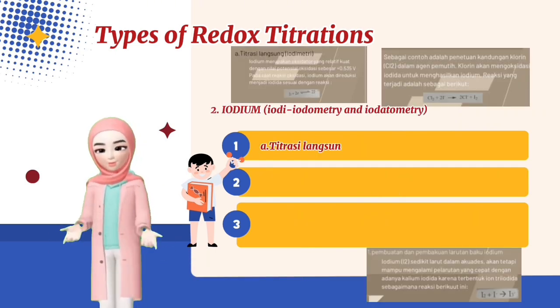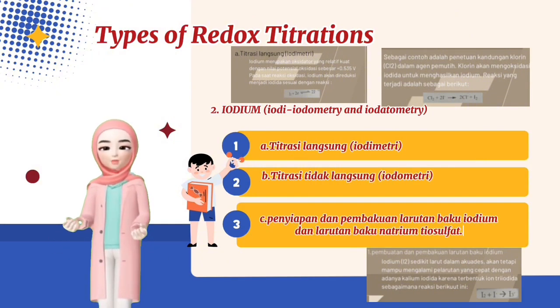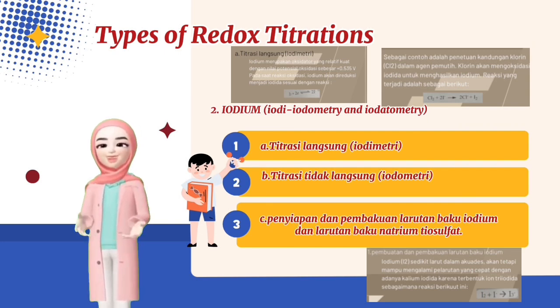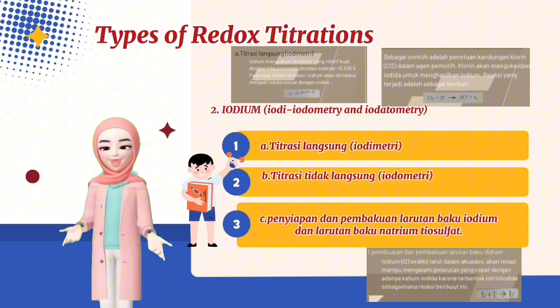Iodine: iodometry and iodatometry. A. Direct titration, iodimetry. B. Indirect titration, iodometry. C. Preparation and standardization of standard iodine solution and standard sodium thiosulfate solution.